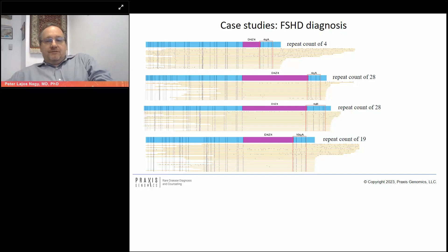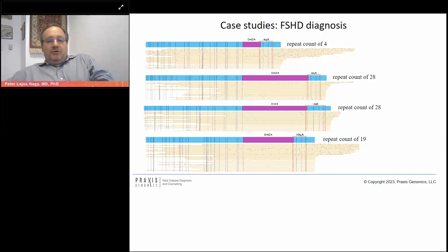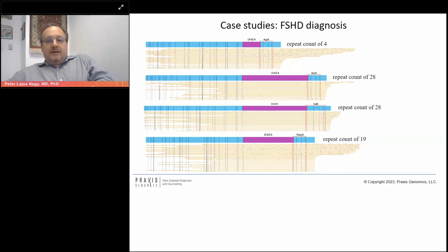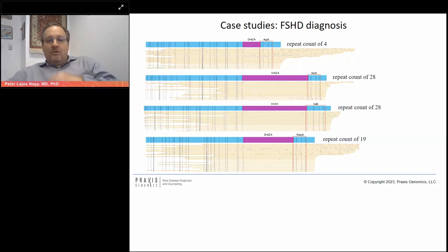Another important usage of optical genome mapping is FSHD analysis, where it can beautifully size the D4Z4 repeats labeled in purple and determine whether it's a polyadenylatable allele — 4QA versus 4QB — as the distance between labels differs between the two. It can also clearly distinguish whether the repeat is on chromosome 10 or chromosome 4, with the top three examples from chromosome 4 and the bottom one from chromosome 10, showing different patterns of the marks.